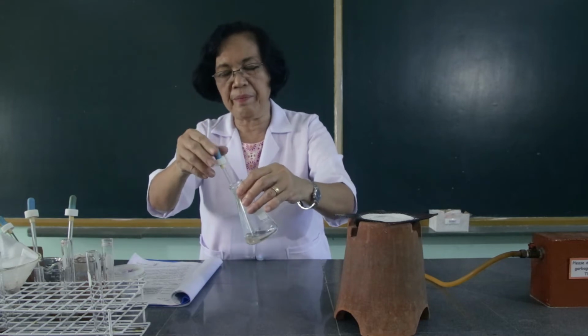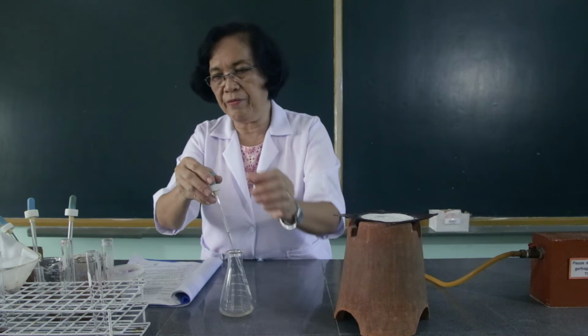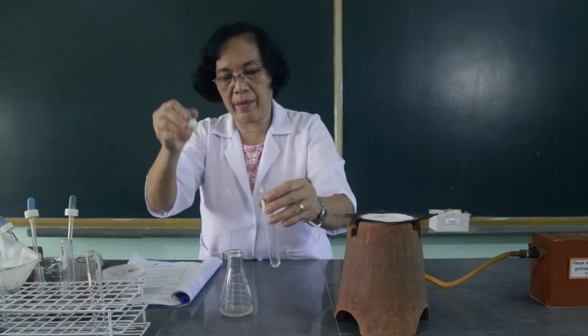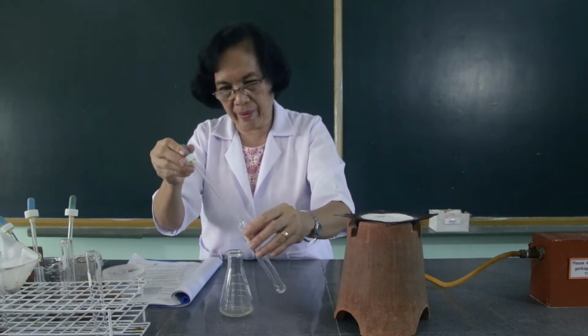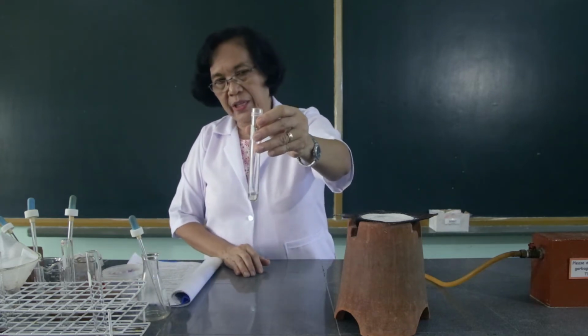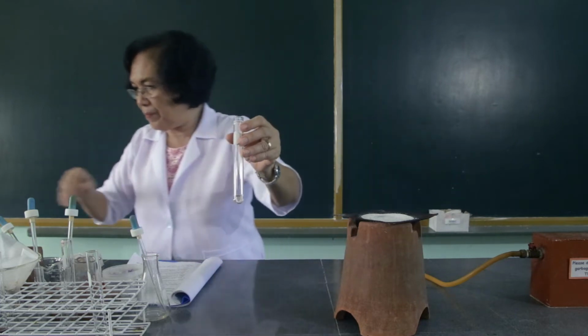Then we're going to submit another part of this filtrate to phosphate test. To this filtrate, we're going to acidify this with nitric acid again.